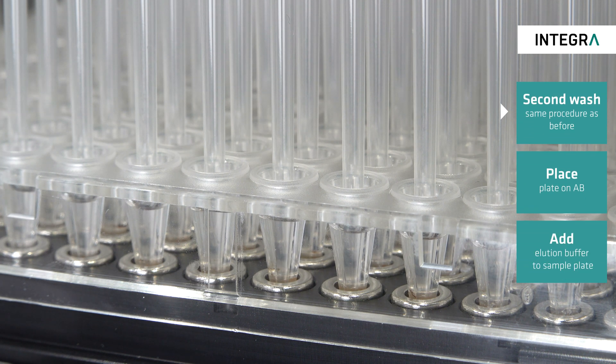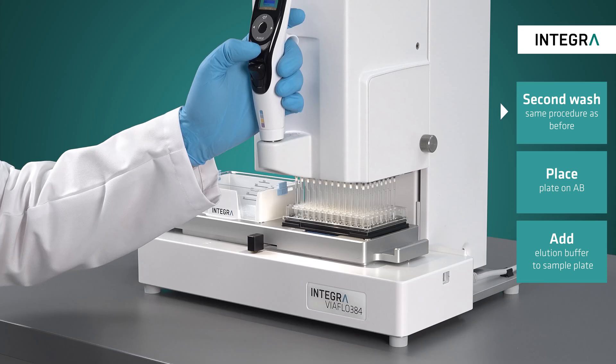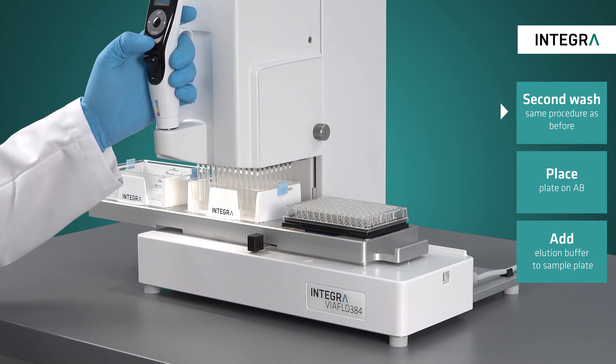This washing procedure is then repeated again using new tips. After the second washing it is especially important to remove all ethanol from the sample before continuing.